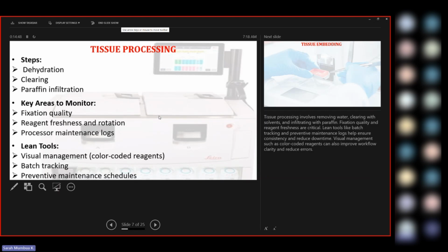In this case, the temperatures are slightly above the melting point of the wax. So depending on the wax you're going to be using in your department, if your wax melting point is between 54 to 55, you can do around 60. If it's between 56 to 60, you can do 65 to 70, around there.